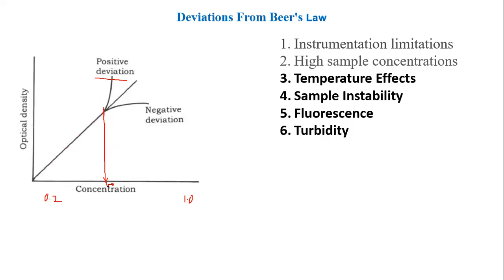And if you increase concentration by a very large value, still there is hardly any change in the absorption characteristics. It's only this much of change. You can see that. I hope that you are understanding how to read the graph. Absorption is seen like this, change here along the y-axis, and concentration is seen like this along the x-axis.